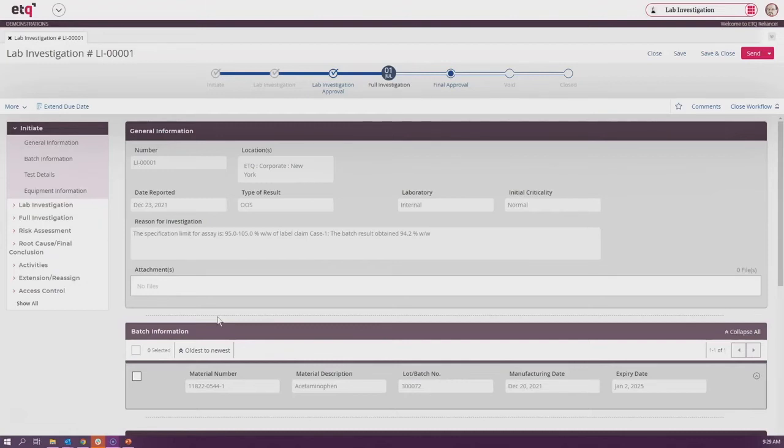As time continues down in the record, he has the opportunity to identify the batch information. This information can be entered in manually, or this could be an opportunity to connect to another business system where this information might be stored and pulled over into the Reliance form.